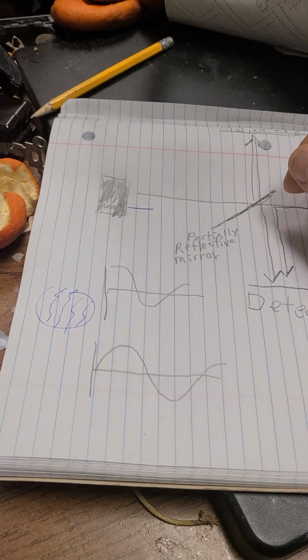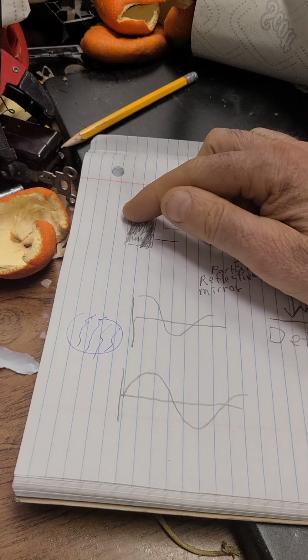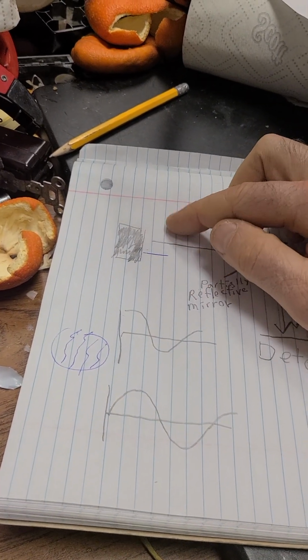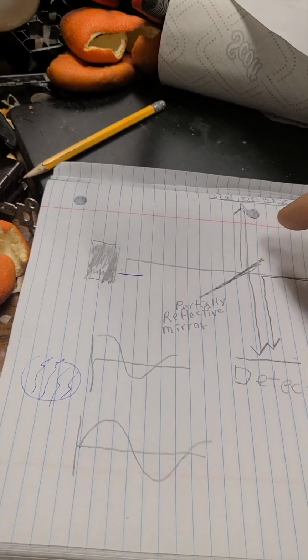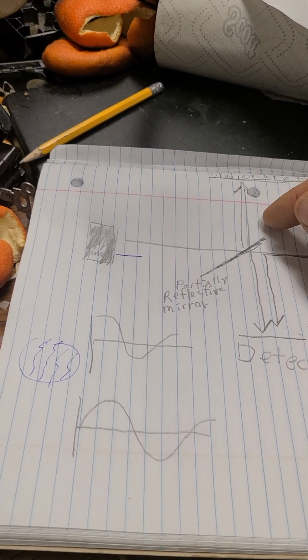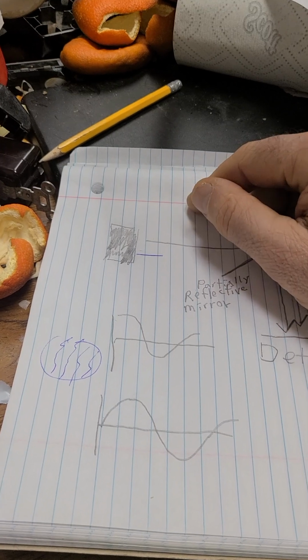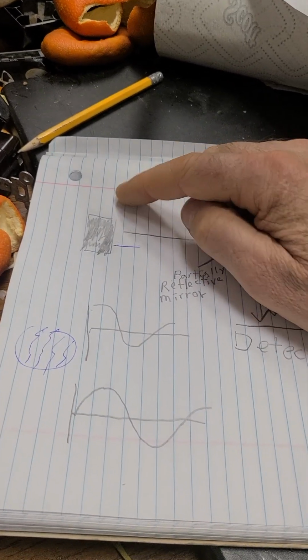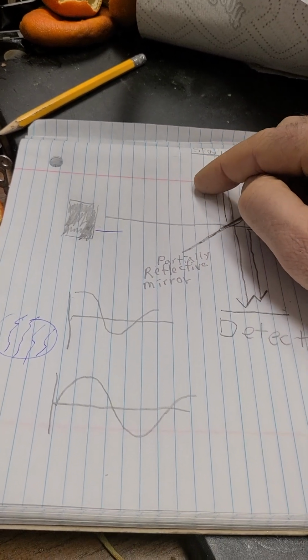Now, one mathematical way to think about or analyze something that's giving off many different frequencies to create the end result of the wiggliness you see: for example, if we had a microphone and picked up audio and graphed it on an oscilloscope, the different frequencies in that audio would create the audio pressure wave sensed by the microphone to rise up, then rapidly zoom up, sometimes have a slow spot.